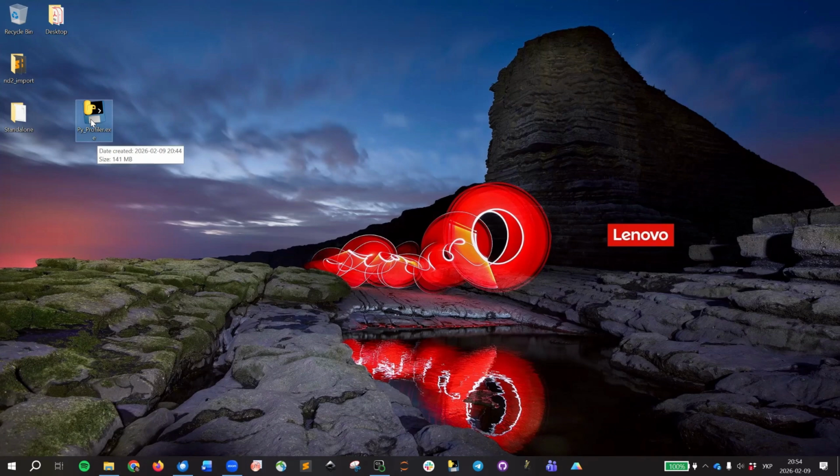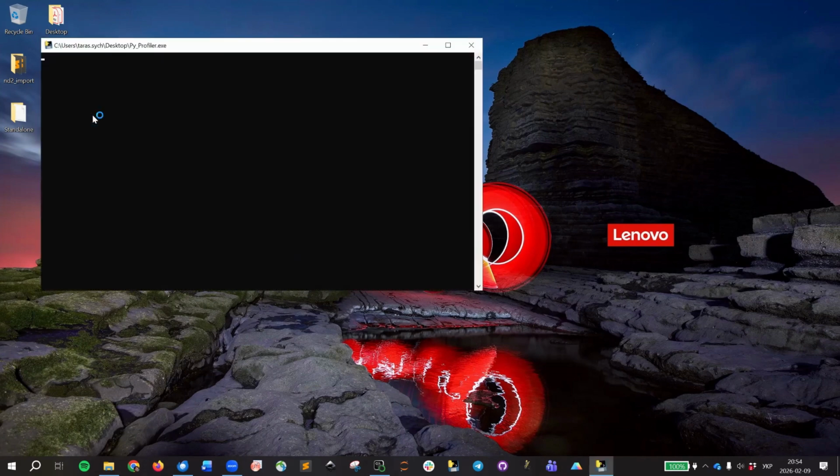So sometimes it is required that you install it on your own. When you have your standalone distribution already installed, you can just launch it, and it takes some time, especially when you launched it the first time.